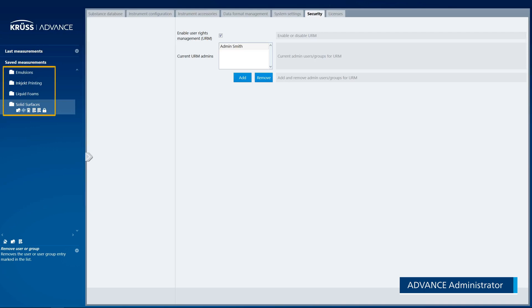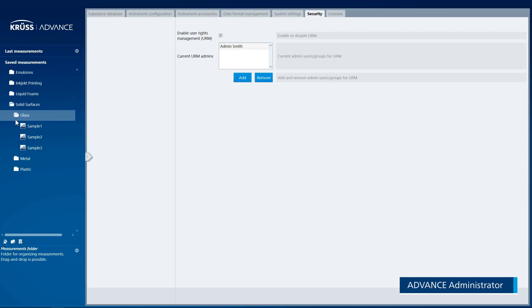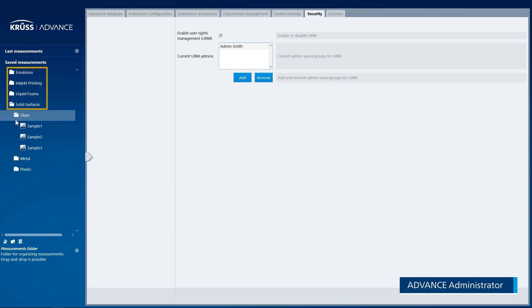User Rights for a Folder are automatically inherited by lower level subfolders and measurements. Higher level folders are not affected by this inheritance.